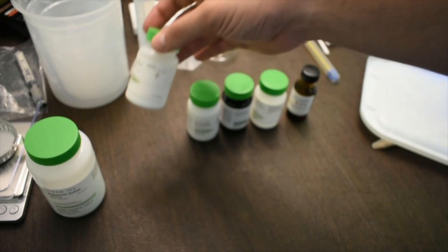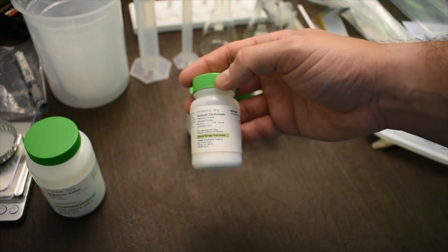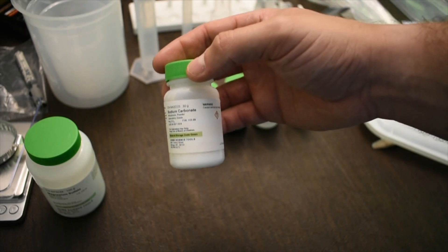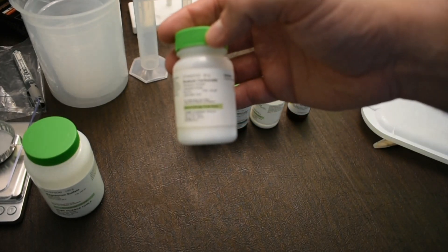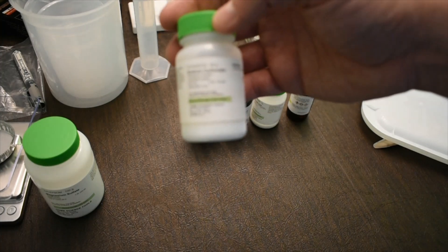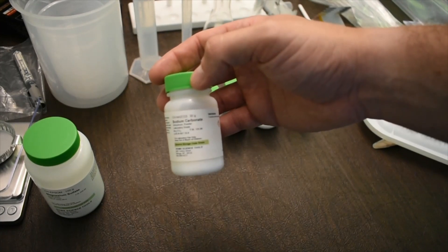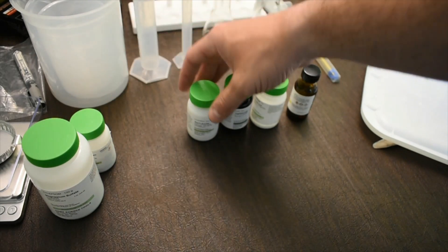The next chemical is sodium carbonate, which has chemistry very similar to household baking soda. Just like baking soda, it can be a bit of an eye irritant, so you'll want to wear your safety glasses when working with it.